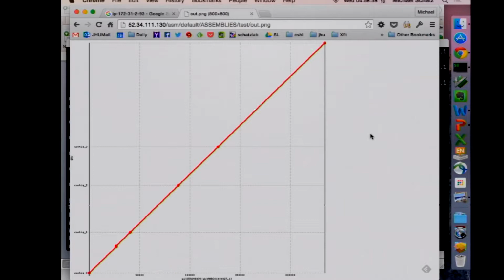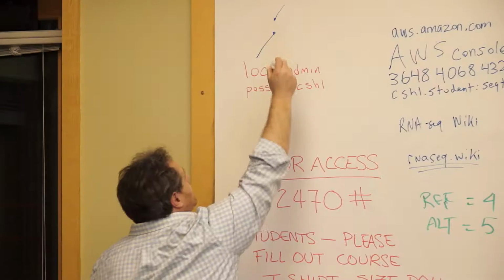It's very boring. The only thing that's a little bit interesting, if you notice here, here's contig 0. Notice here there's these funny dots. What that is saying is that there is a structural variation here where the contig we just put together has a bit of sequence that is not present in the reference genome. If we had it set up a little bit better, we could zoom in on this. If I blow up just that segment, it'll align, and then it'll jump straight up, and then it'll keep aligning.